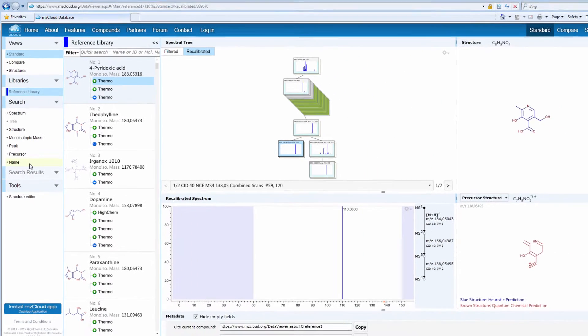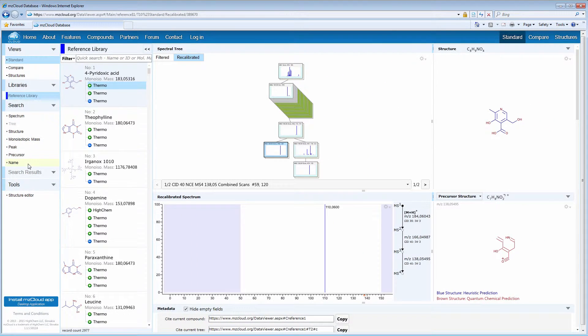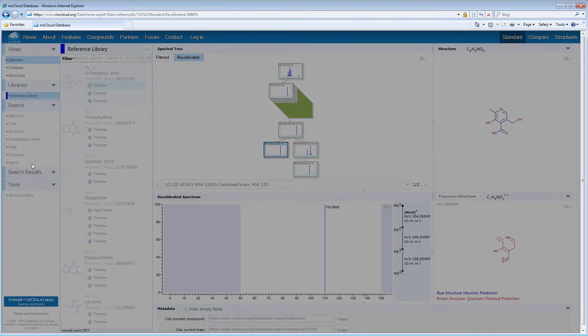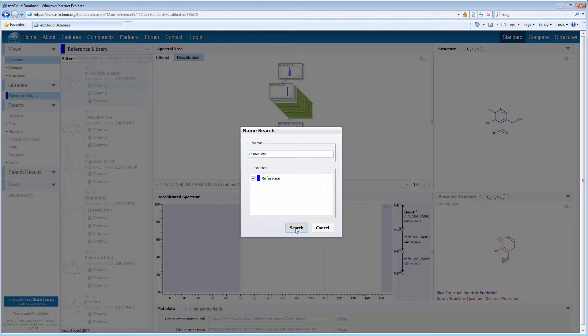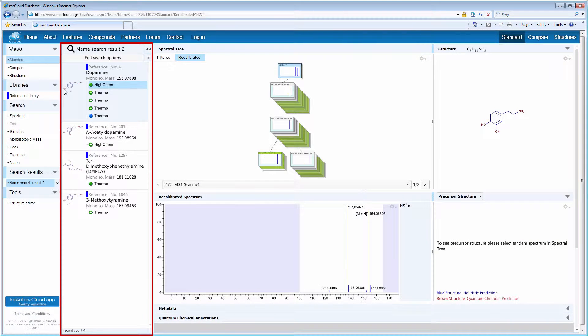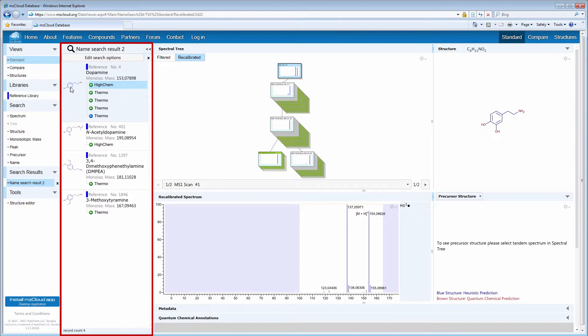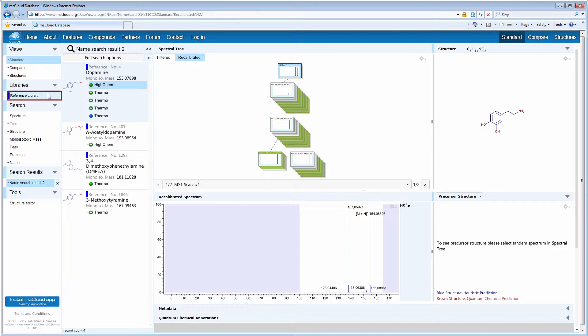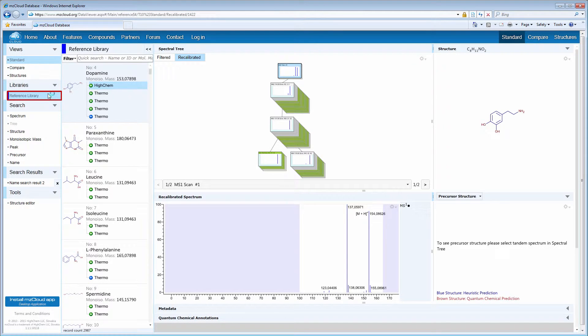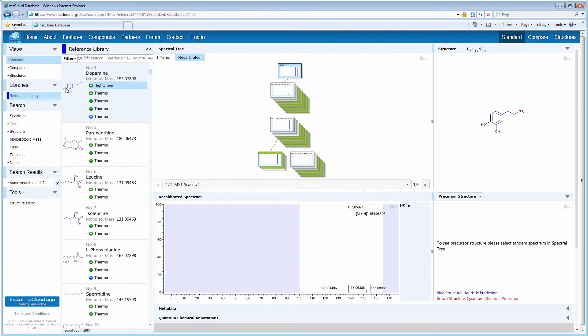If you search with any one of them, for example the Name Search, the results will end up in the Search Results pane. To go back to the full library view, click on the Reference Library menu item.